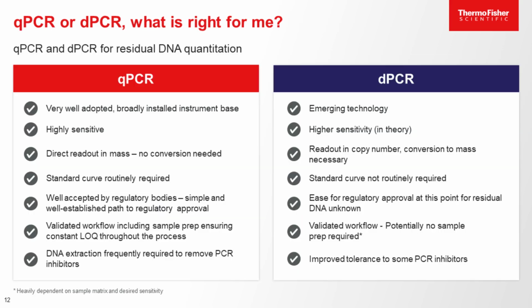So now let's get to the second last page to go through some characteristics of both technologies from a perspective of residual DNA quantitation, right? And to pick which one is the right technology for me that we want to help you with. So from a qPCR standpoint, obviously it's very well adopted with a huge install base. dPCR, on the other hand, for this application, I would still consider it emerging, right? It's not so broadly installed and utilized.